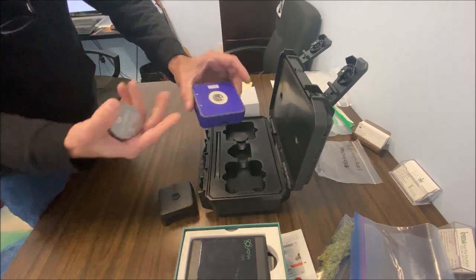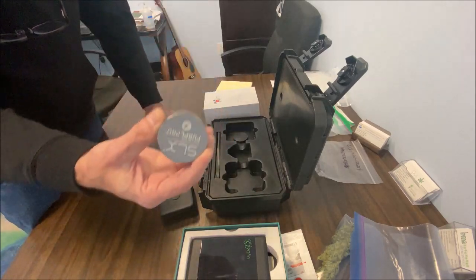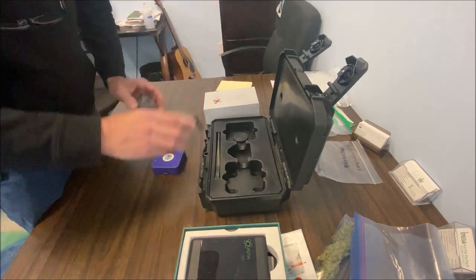So we've got 3 pieces that we use. This is the actual unit that shines the light. This is a grinder, just like your regular grinders, and that's just a little funnel holder.